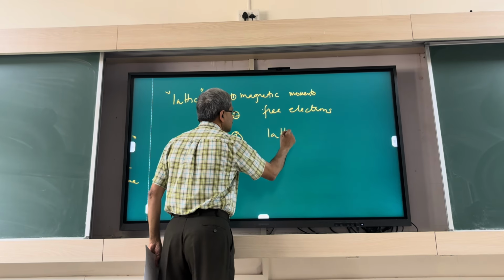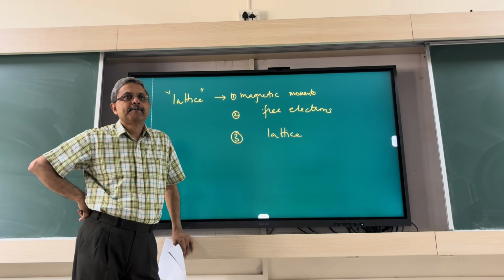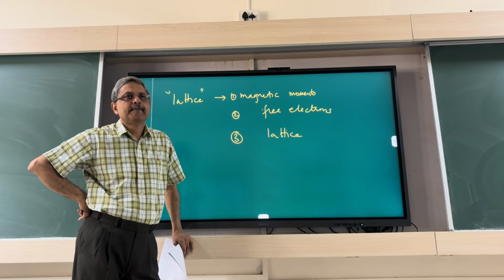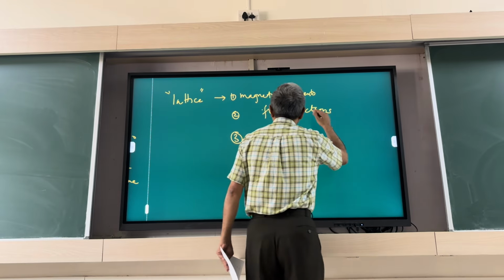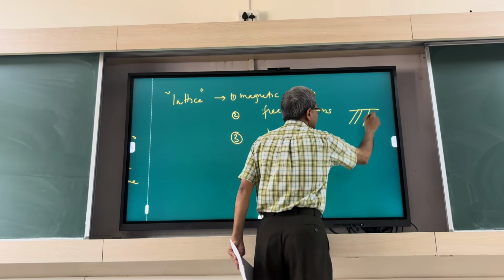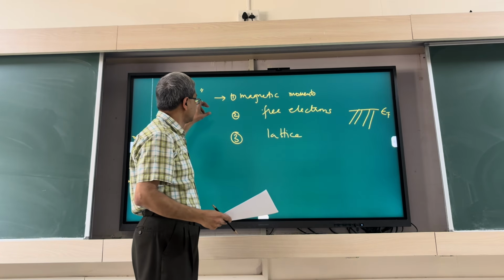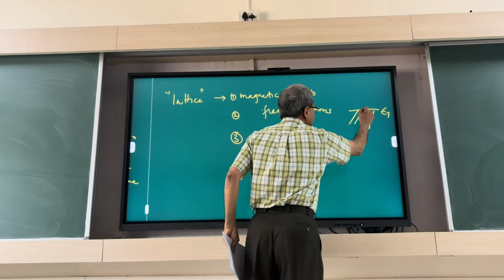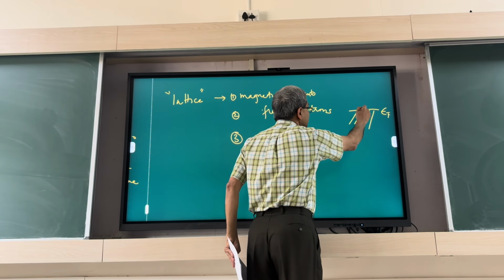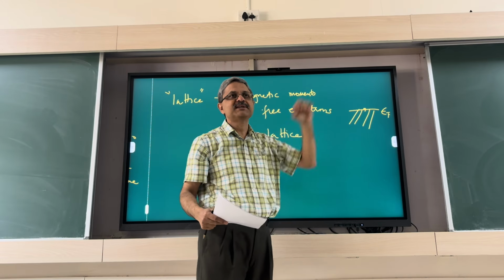Sir, how is it possible, because the electron magnetic moment is larger compared to the nuclear magnetic moment? How do you relate that amount of energy that is transferred? So for free electrons, for example, you have some energy level scheme. You have the Fermi level, and available states above that. Whatever, say micro eV, loss you get in the energy of the nuclear system has to be taken up by states available just above. So it has to be taken up by the free electrons. Size of the moment is not the issue. What is the energy level scheme is the point.